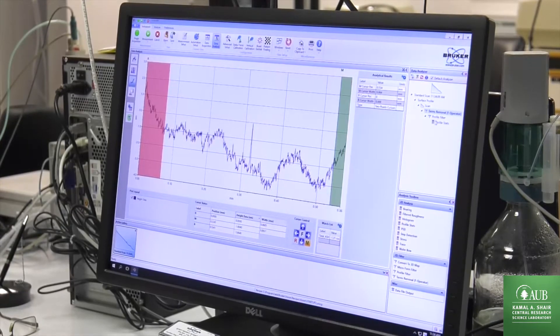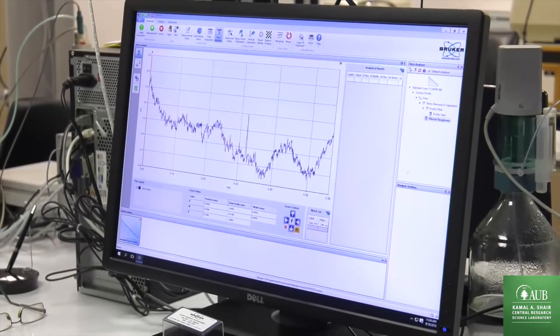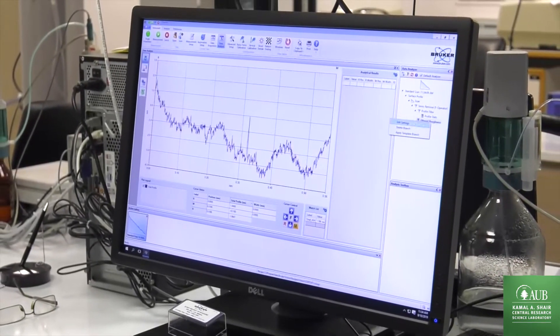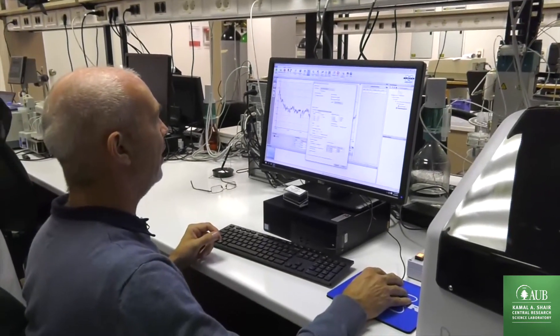And then instead of using profile stats, I select the filtered roughness analysis tool here. And edit the settings, I turn on the cutoff wavelengths.